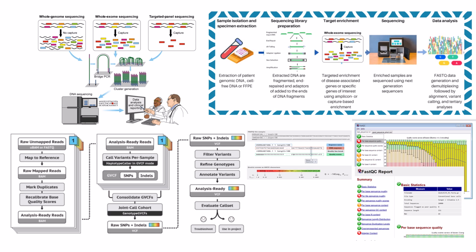Okay. And perhaps most critically, clinical significance from databases like ClinVar. Has this exact variant been reported before in association with the disease? Has it been classified by experts as pathogenic, likely pathogenic, benign, likely benign, or very commonly a variant of uncertain significance, VUS? So connecting it directly to known clinical findings if they exist.